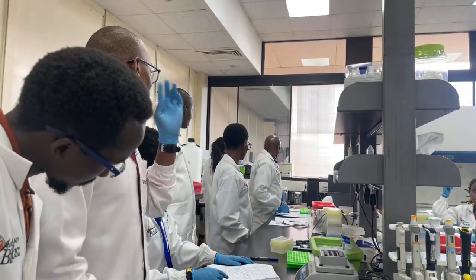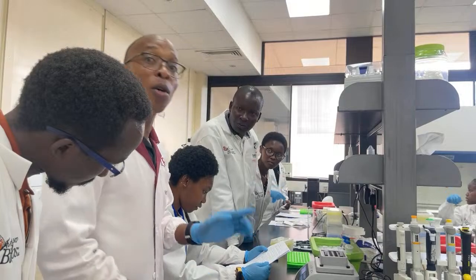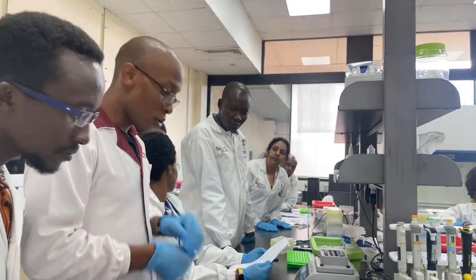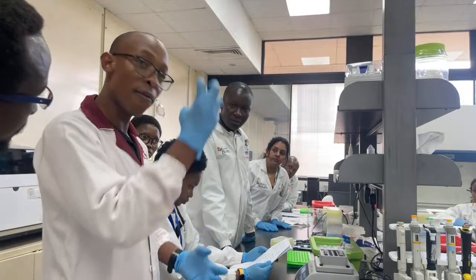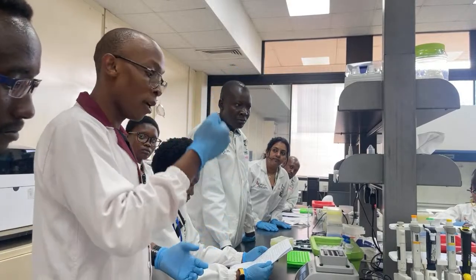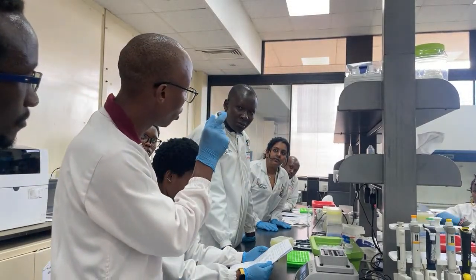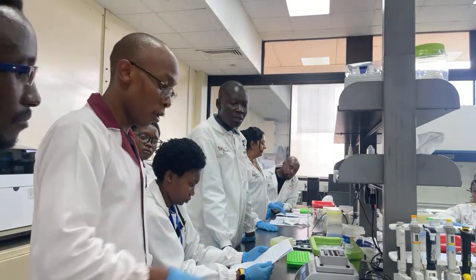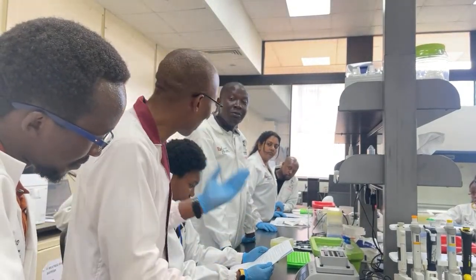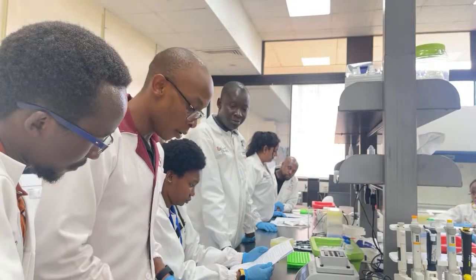I think they've set already. Yeah, 20 degrees. And after that, this is a step where we take care of the supernatant, because that's where our DNA is. After the centrifugation there, we will have the supernatant, and like you did with the Monarch kit, you nicely take out the supernatant without disturbing the pellet into a new tube. In a few steps, you'll be able to see the DNA with your naked eye. There'll be some cloud in there. If you discard that, you might as well pack and go because you're not going to get anything. So be careful that we don't discard the supernatant this time. We keep it because that's where the DNA is.